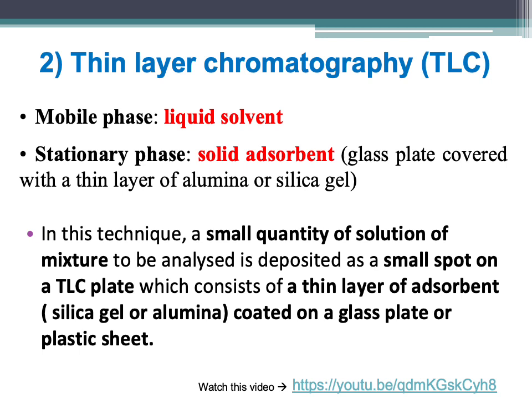Okay, beza dia hanya tu saja. Tapi cara dia, teknik dia adalah sama. Kita still letak satu spot pada line. Kita buat satu line and then kita letak spot. And then kita tengok dia pergerakan spot tu after kita letak dalam mobile phase. Okay, the liquid solvent. So for more information, you can watch this YouTube video.